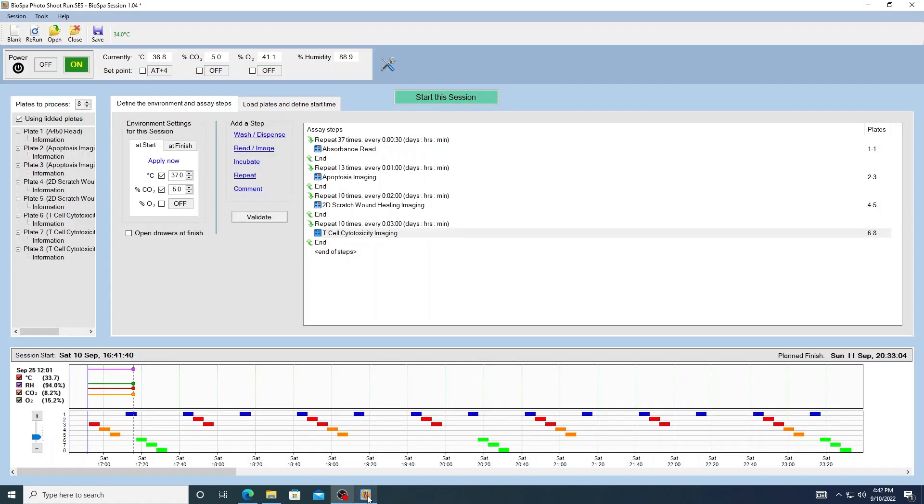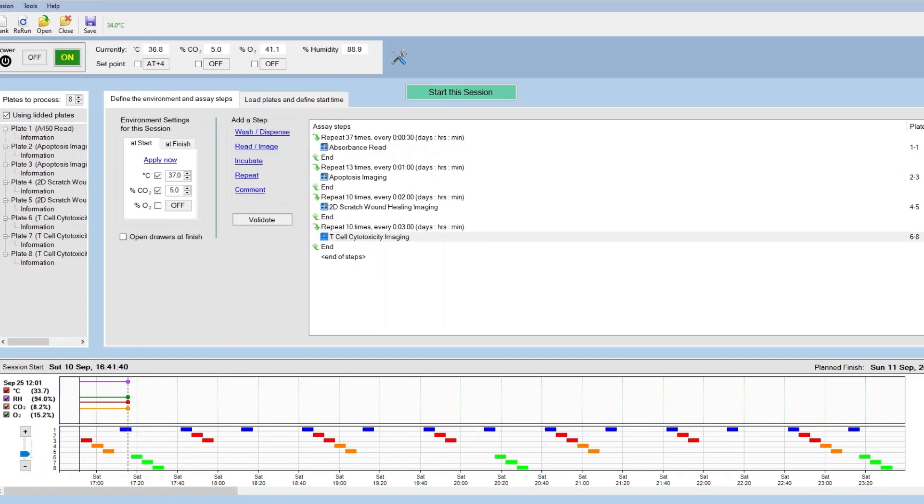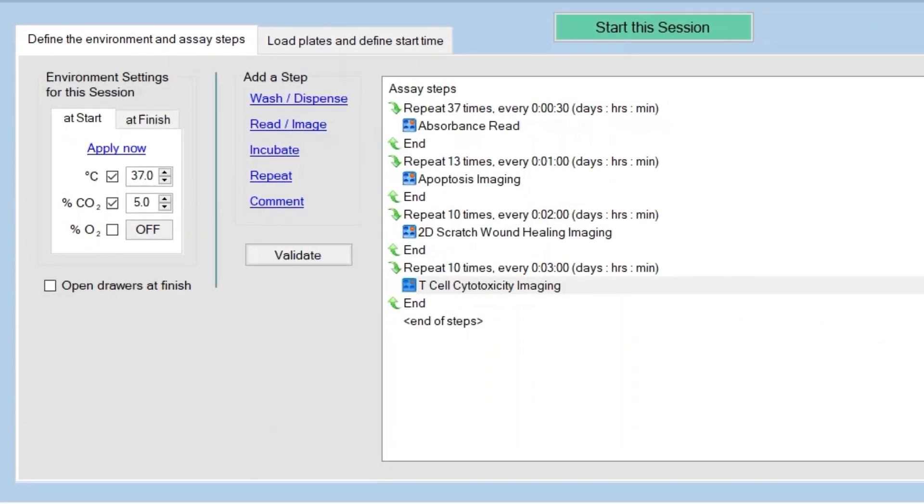The BioSpa and all attached instruments are run by Agilent Biotech's BioSpa software. Two different modes can be run, session mode and on-demand mode. In session mode, one or more different kinetic protocols can be run at the same time.